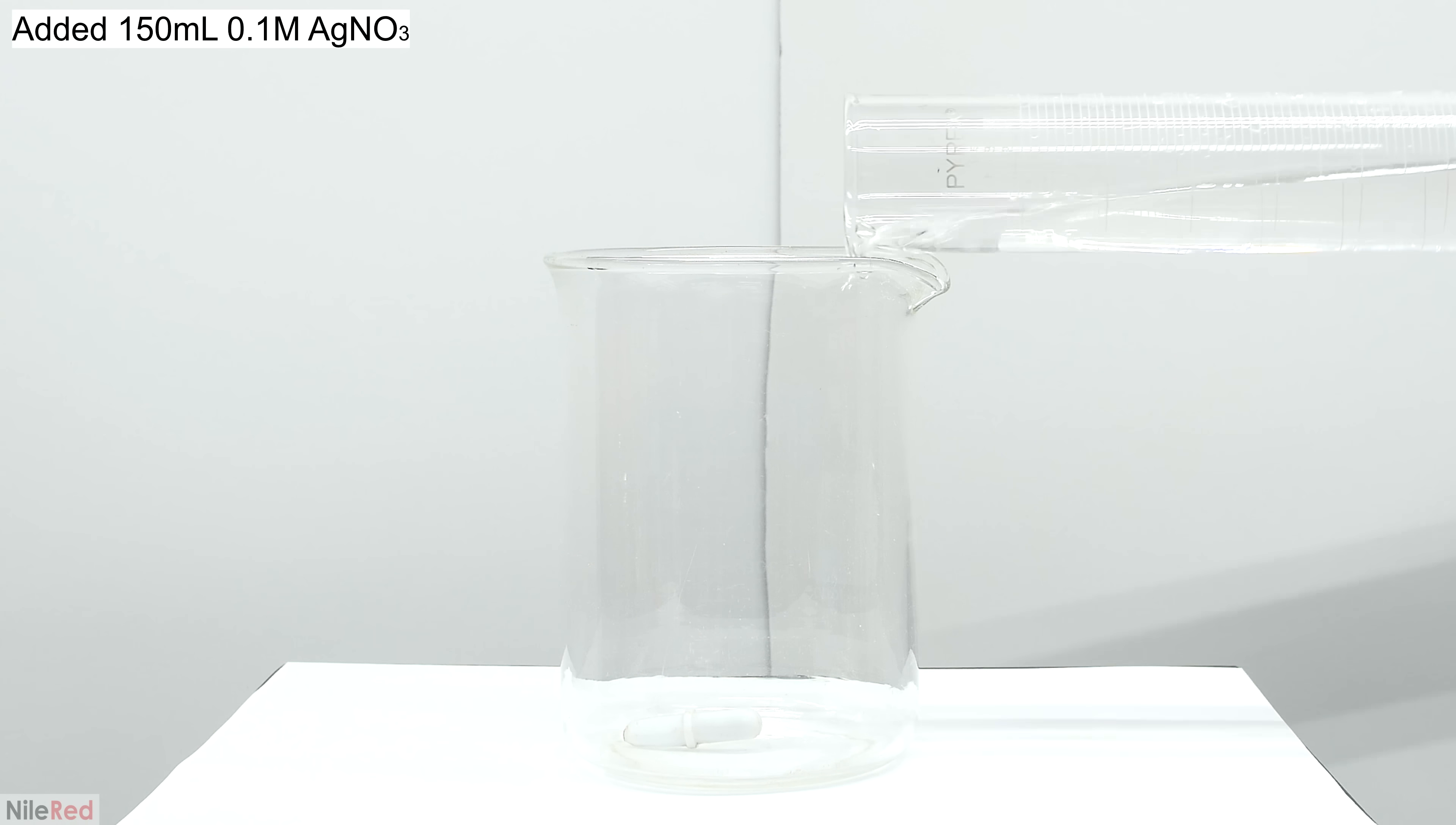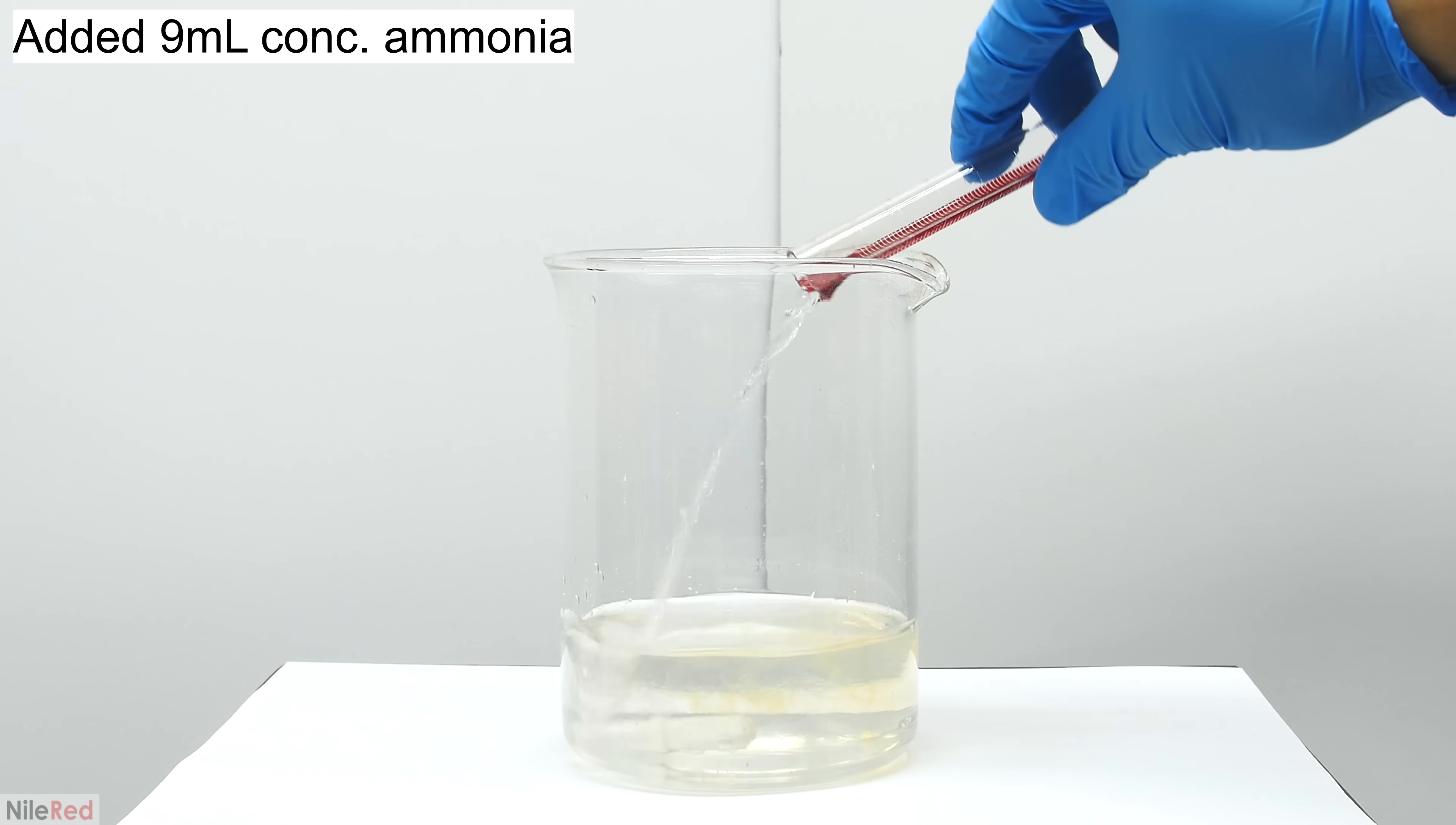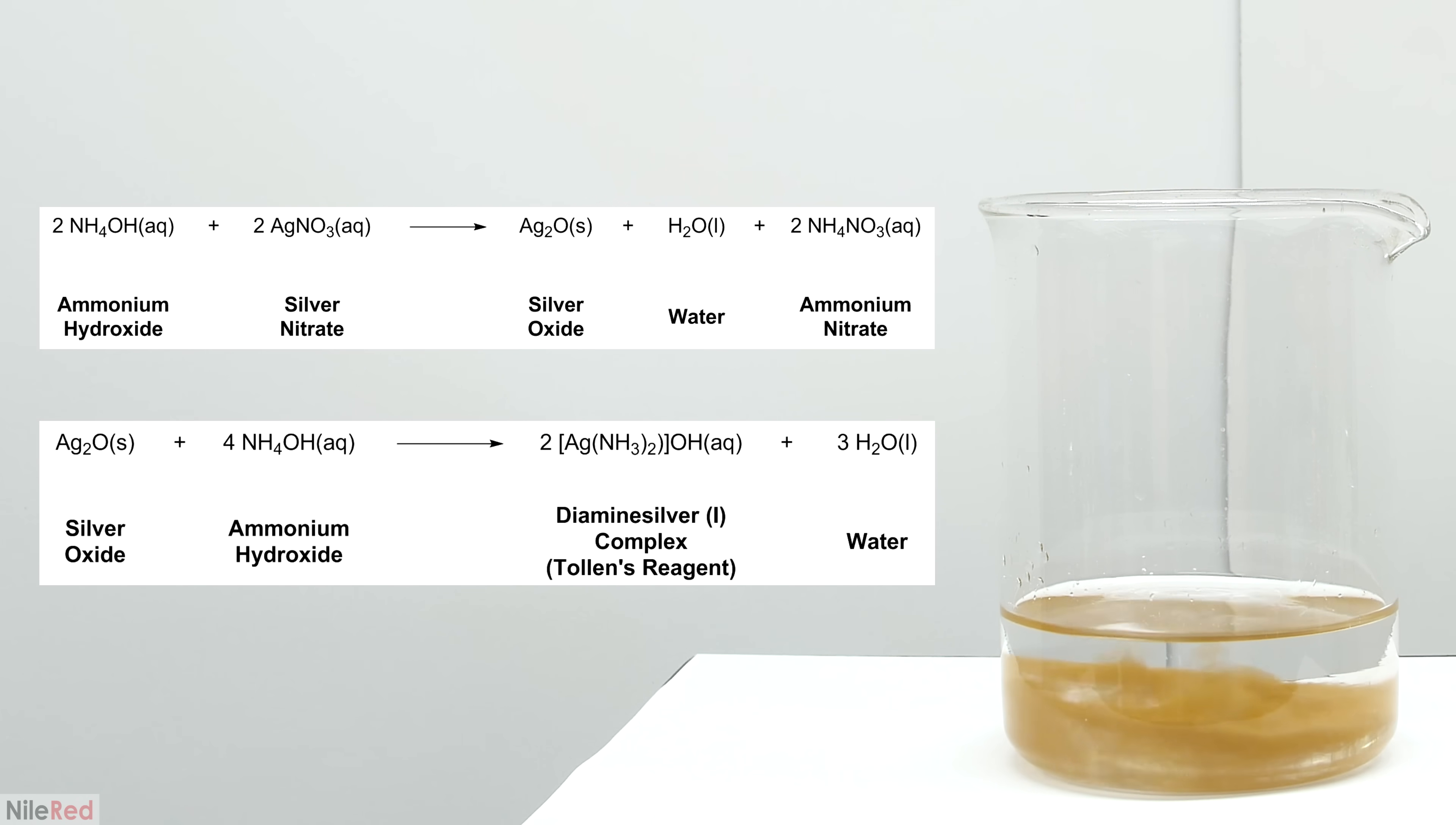Now it's time to make the Tollens reagent. To start things off, I measure out 150 milliliters of the silver nitrate solution. I then pour in 9 milliliters of concentrated ammonium hydroxide. This leads to the formation of brown silver oxide. However, in the presence of ammonia, silver oxide will react with it and form a soluble complex.